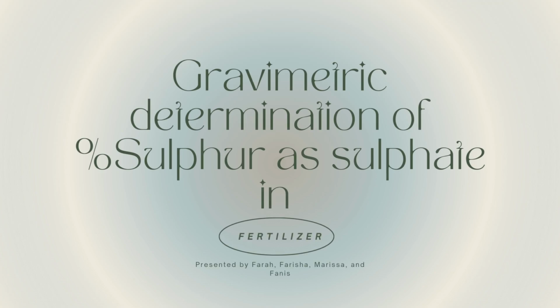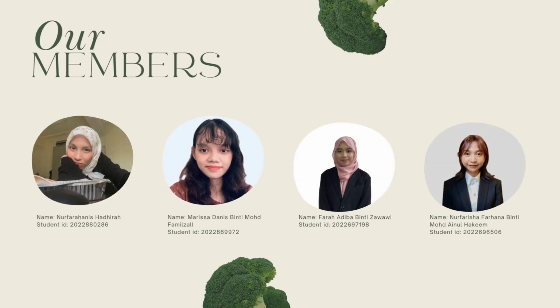For today's presentation, we're going to talk about the gravimetric determination of the percentage sulfur as sulfate in fertilizer. And these are our four presenters.